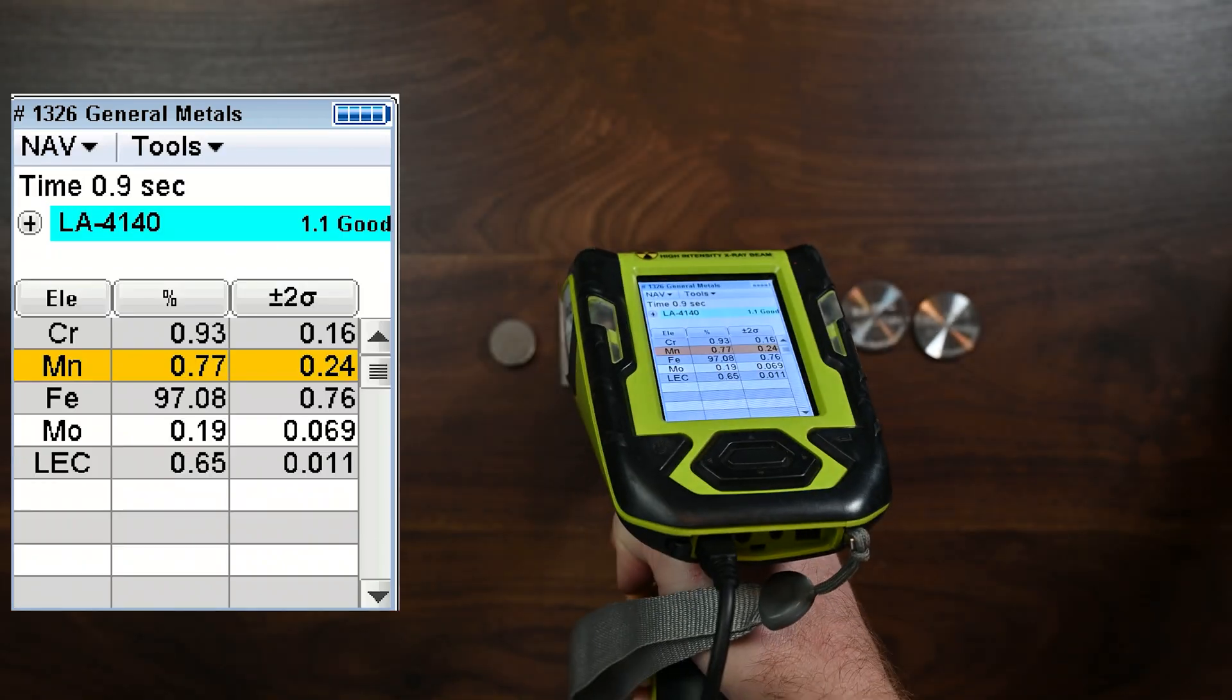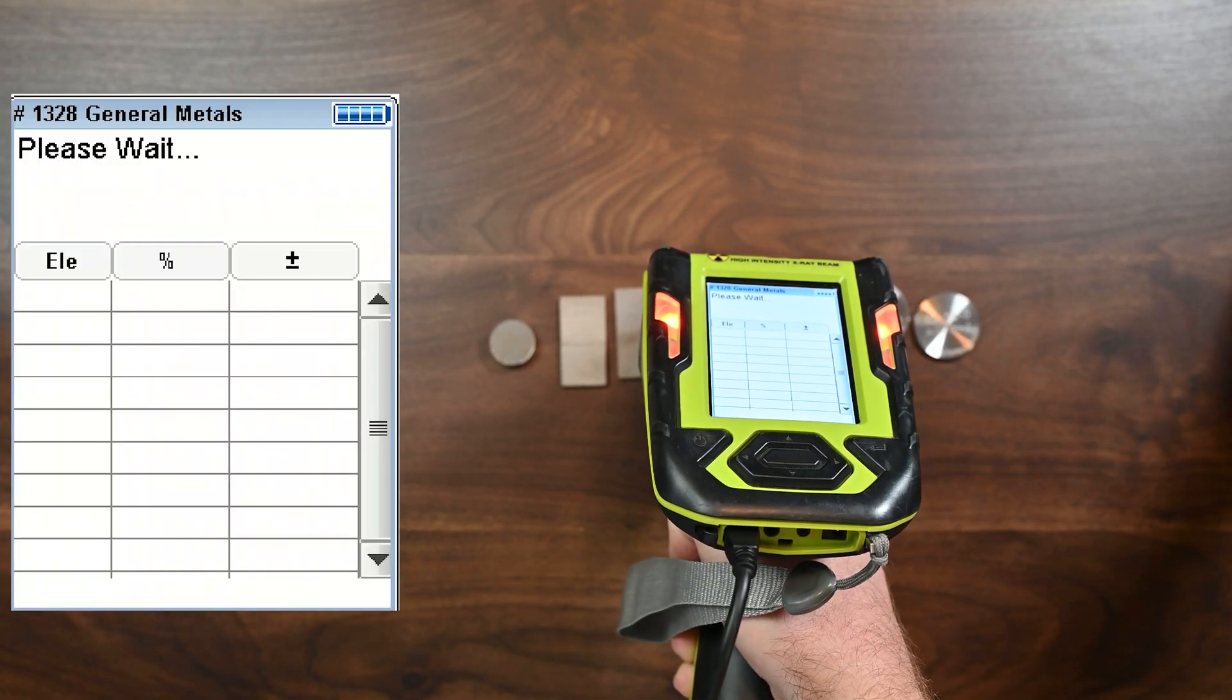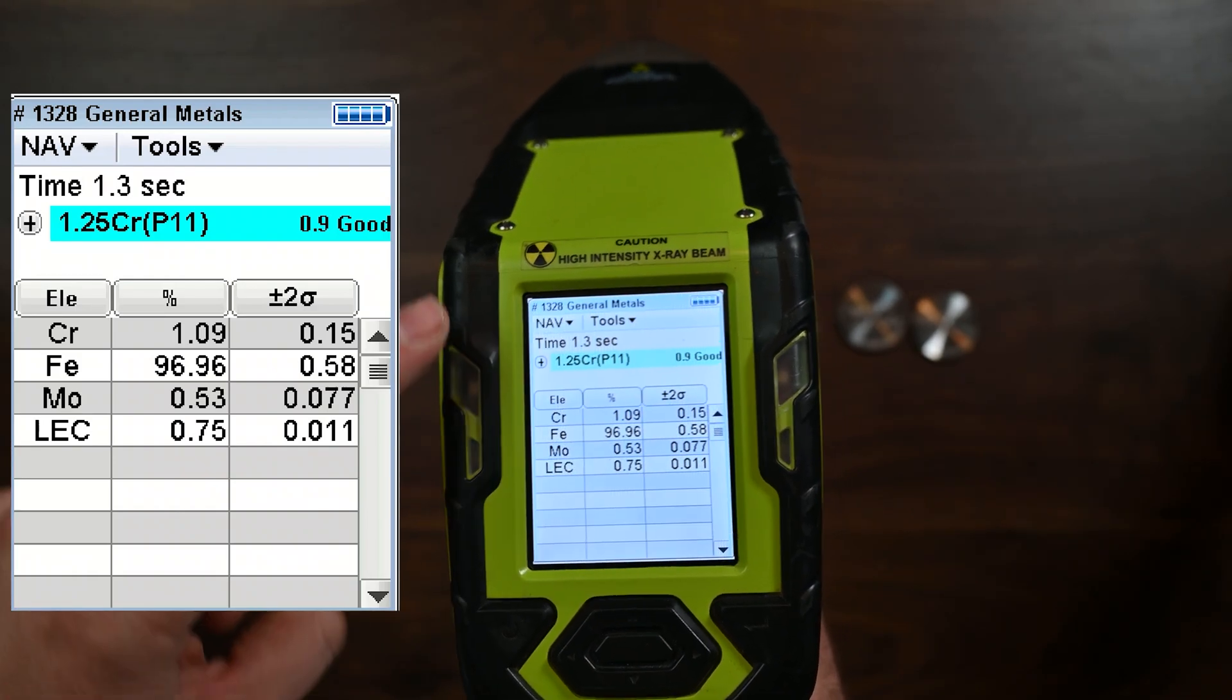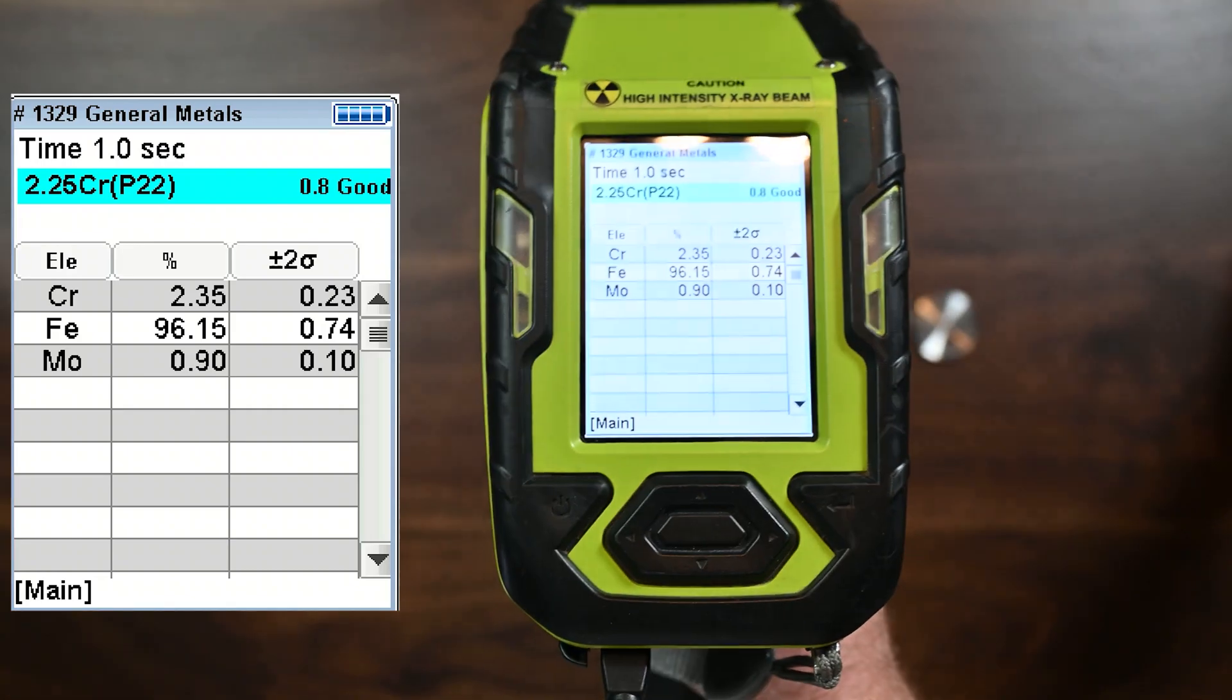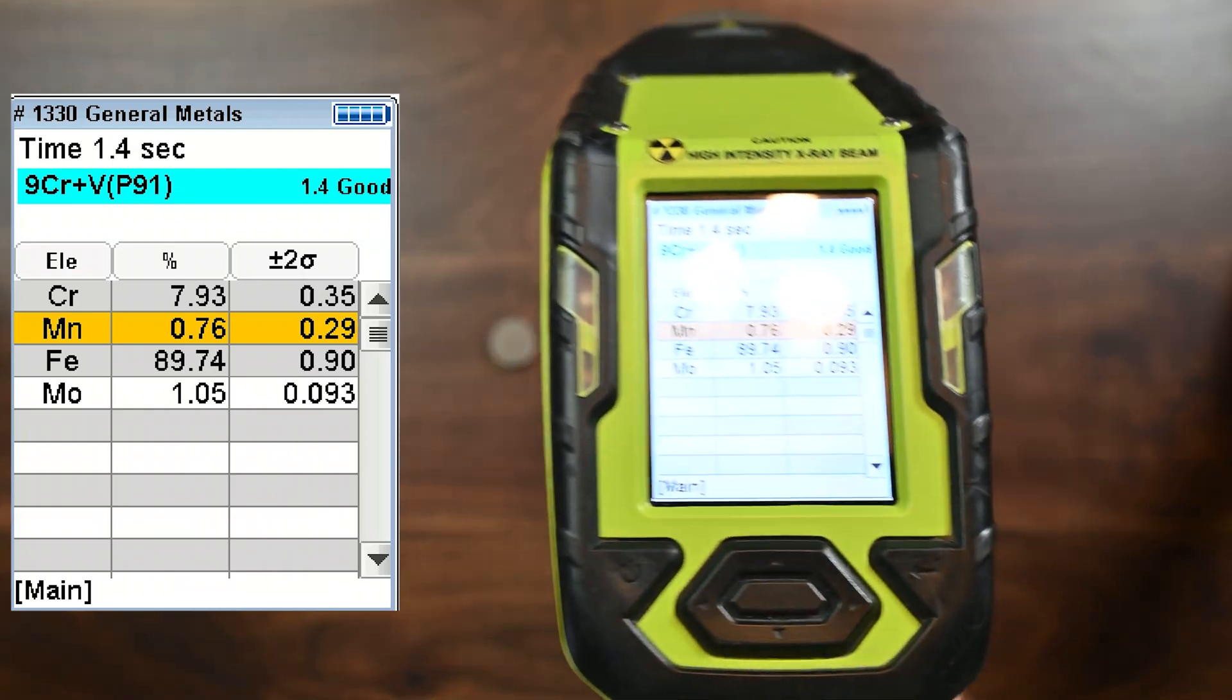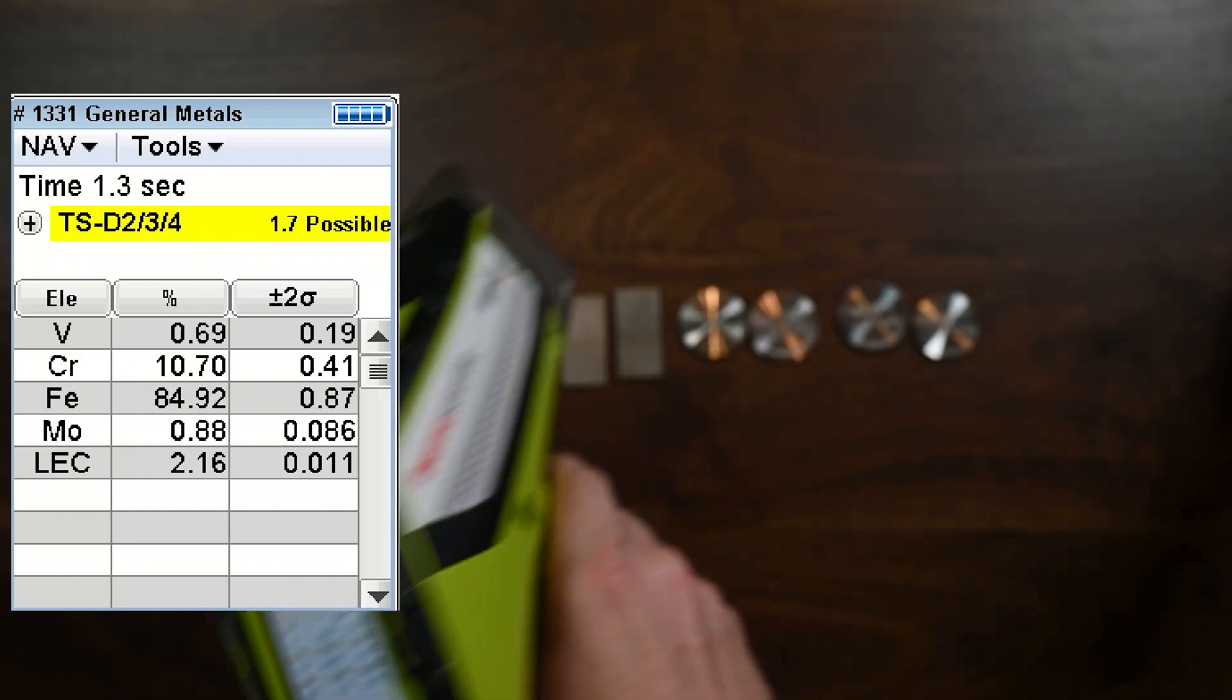Now let's go to the next one. We have 4140 there, one second. Next one: 4340 there. I guess 1.1 seconds, but really fast. I mean, this analyzer is lightning fast for identifying these grades. And you're thinking, well, you could do a longer analysis and I can, and we will, but to start, let's just look at the speed. So look at that one and a quarter chrome, pick that up right away. Let's try the two and a quarter chrome, and it picks it up right away. Even before the analyzer is beeping, you're actually able to identify the grade on the analyzer itself. There's our nine chrome, really easy to pick up. And how about our D2, our tool steel? I'm going to be able to pick that up. You better believe it. So again, one second into doing all of these analyses.